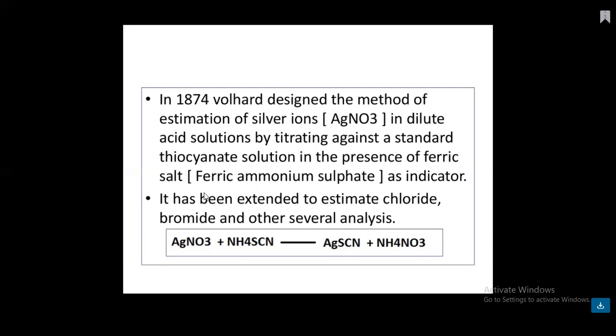First, the precipitation is formed between titrant and analyte, and the silver chloride or the silver iodide or the silver bromide will form. When all of these halides are consumed, then the leftover volume of the silver, because we add an excess amount of silver, is quantified with the help of a third reagent that is present in the burette. The burette also contains the thiocyanate.